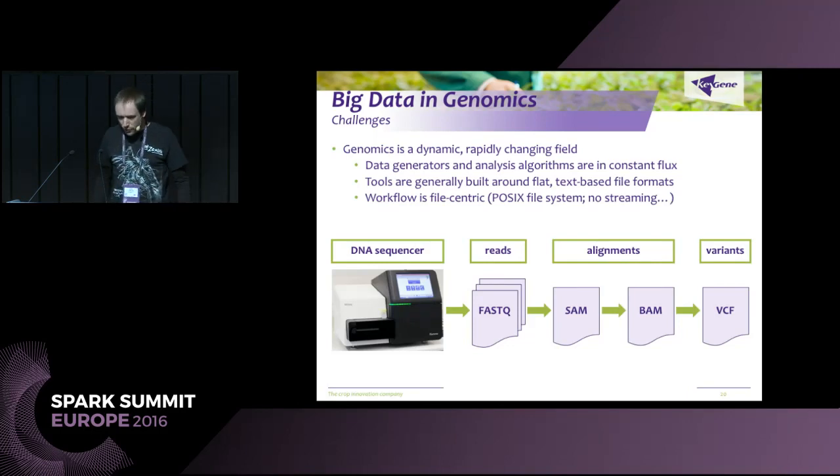The challenge that we see, of course, is that we have this rapidly changing field with new technologies and new tools coming in all the time. The tools are built around files, so we have to deal with files rather than streams of data or datasets that you can store in memory. You have to read from a file, so you always go from file to file to file to your end result, which is also a file.